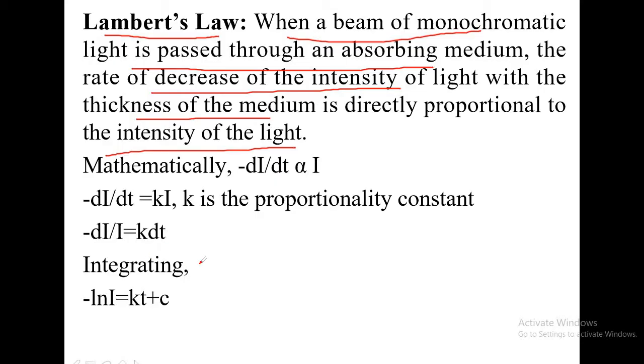If we integrate this, minus dI by I is nothing but minus ln I, and k is a constant. The integration of dt is t. So plus c.